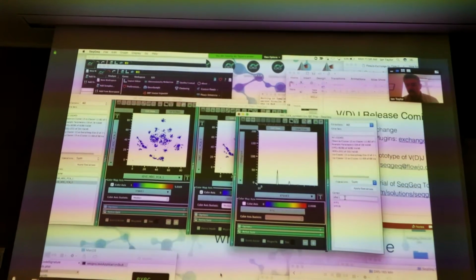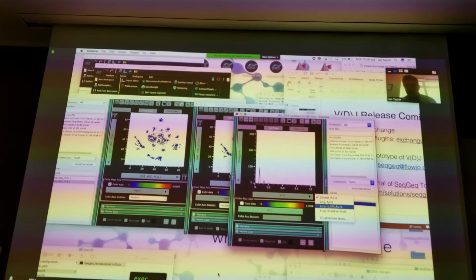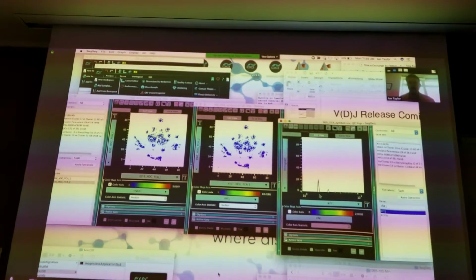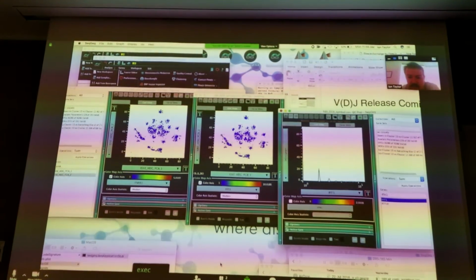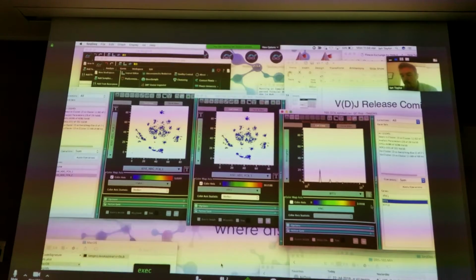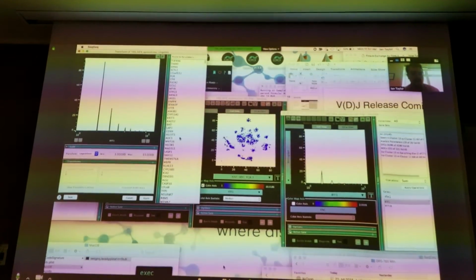There you go. Oh, I see. Then it shows you. They're often more useful to look at on a log scale. It looks like whatever this island here has a lot of IFIT1, macrophages. And IFIT2, you have it there.